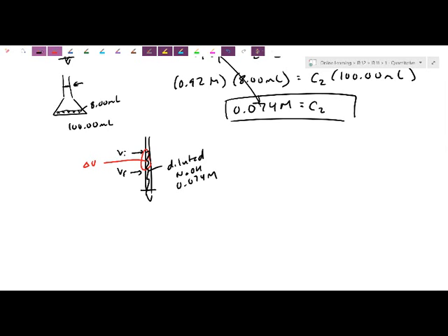because that's actually how much solution you tossed in. And what I did is I tested it against my HCl, started off with about 100 milliliters. I only tested off a 25 milliliter aliquot. So 25 milliliters, that was from a pipette. This is unknown concentration HCl. I know it's roughly 0.1, but the whole point of doing this titration is to try to figure out what this number should actually be.